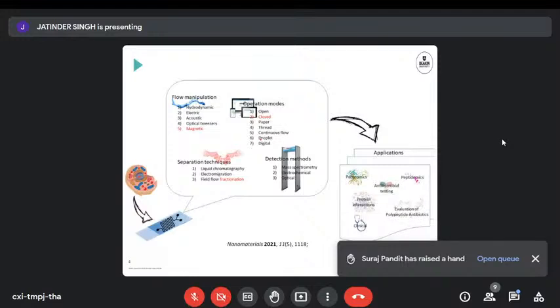Different separation techniques: field flow fractionation is popular for proteins. We've got our electromigration, our chromatographic approaches. Detection can be optical, either using the absorbance ratios of proteins. An absolute blessing are fluorescent proteins, so green fluorescent proteins or R-phycoerythrin are naturally fluorescent. Really, if you want to demonstrate a concept with a protein, pick those because you don't need to do any labeling. Electrochemically, there's electrochemically active proteins, or you can label them so you can see them electrochemically.